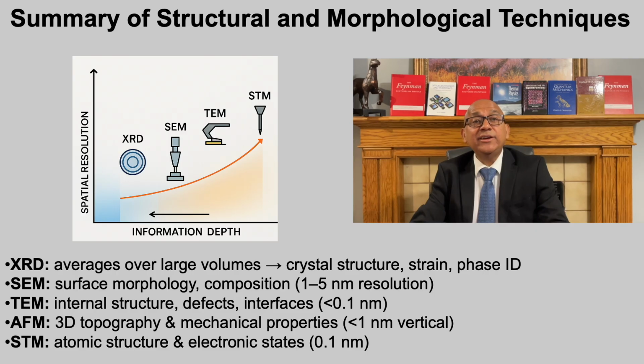SEM provides real space surface imaging at 1 to 5 nanometer resolution, showing grain size and composition, though limited to near surface regions and often requiring conductive coatings.